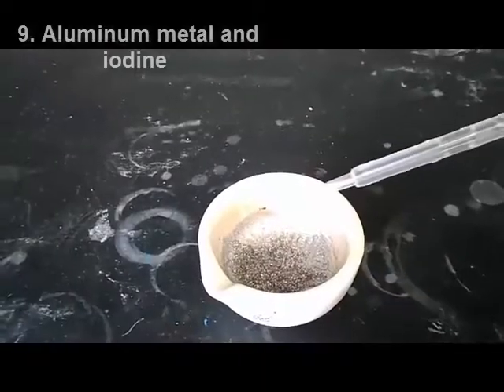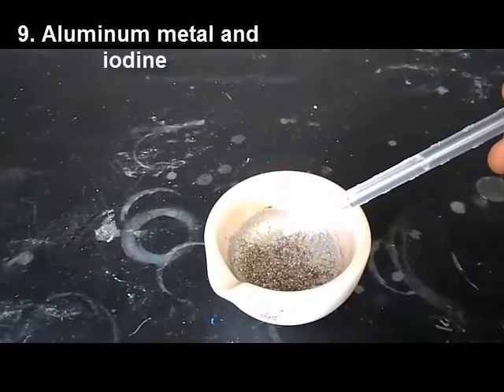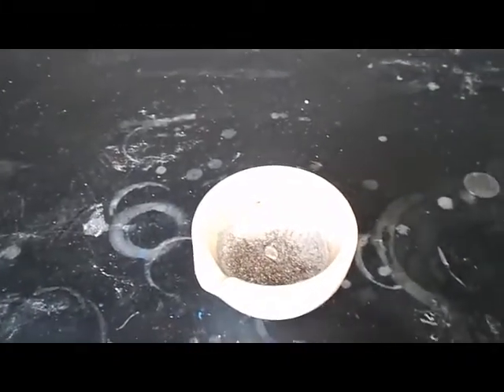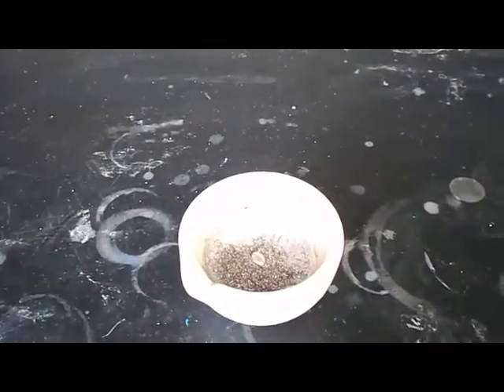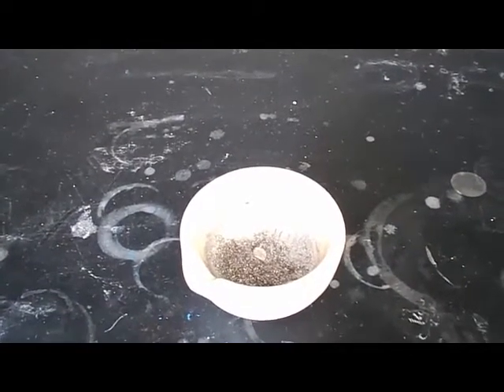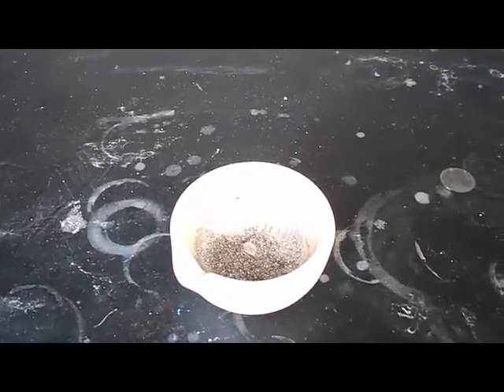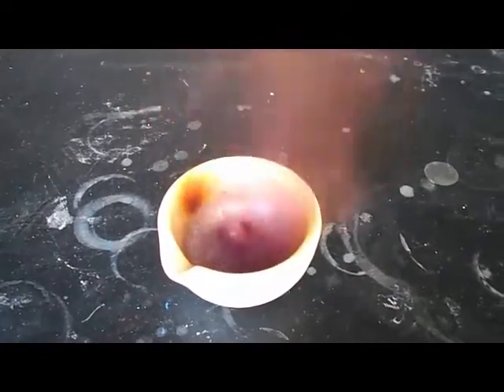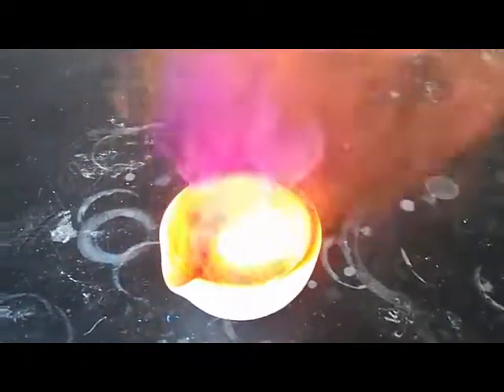So, I've got one more to show you, but we have to go to the fume hood to do it, so we'll do that. So what you're seeing here is a mixture of two powders, powdered aluminum metal and powdered iodine. Aluminum metal is sort of silver or gray, and iodine is purple. And I've added just a couple drops of water to get things going. Once things start to react, it's very violent. We even get some fire.